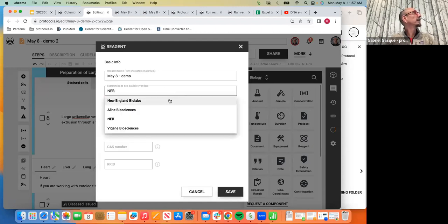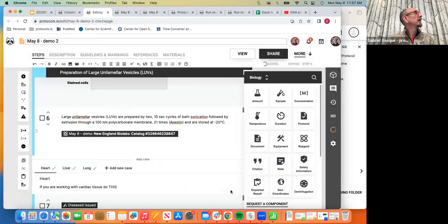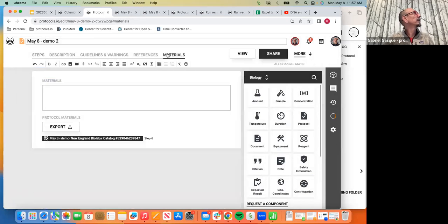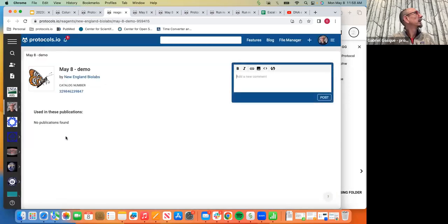New England Biolabs. And then if I go to materials, no, I don't think that you can edit it, but let me double check, Marlena, and get back to you.